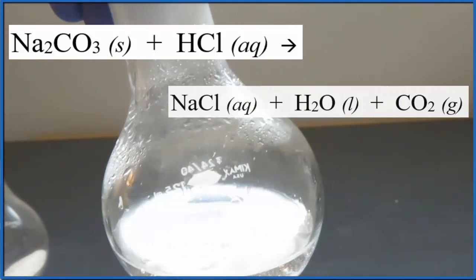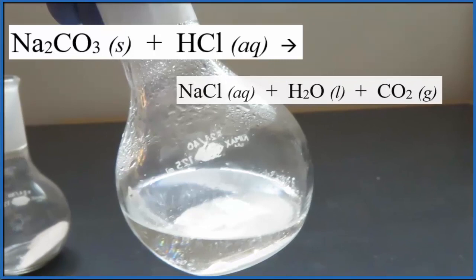And if you look at our flask here when we're done, you really don't see much solid in there. And that's because that NaCl, it stays dissolved in the water. The water, H2O, is just water, and the CO2, that left the vessel.